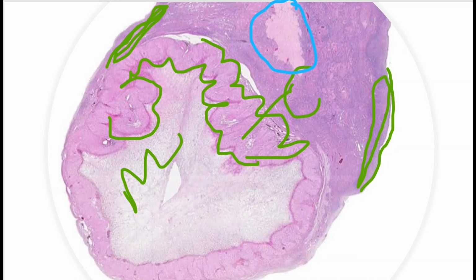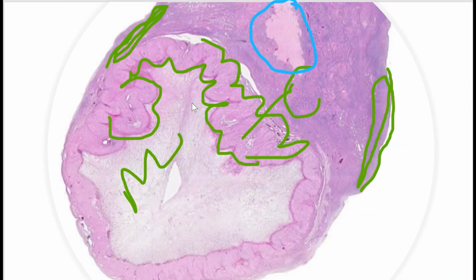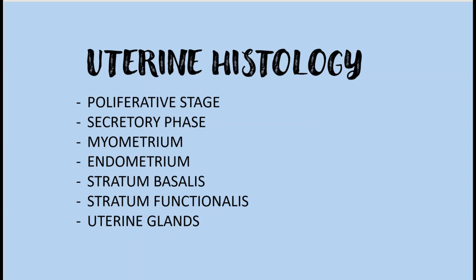All right. So the best thing with these, the albicans and the luteum, is to just look at as many slides as you can to try to see the different stages of each. But most of the time, this one to me looks like cotton candy. And then this one always looks like it's got something going on the outer edges. I don't know. That's just how I do it. Okay, moving on.